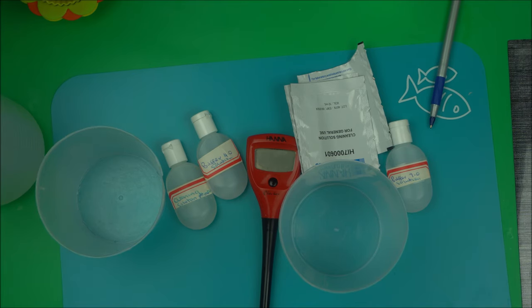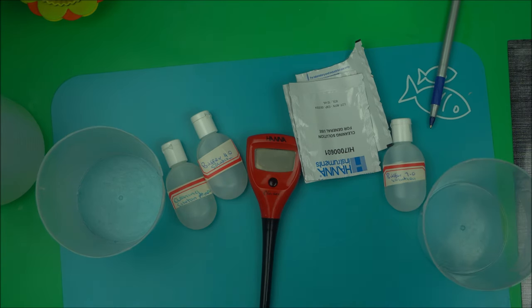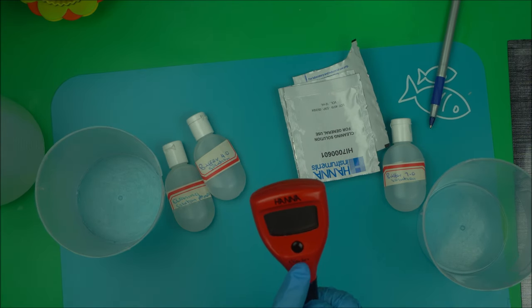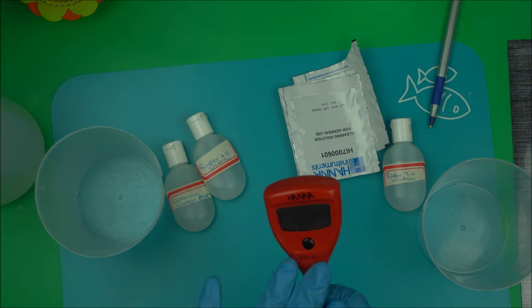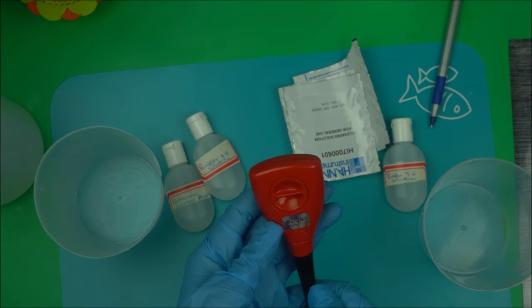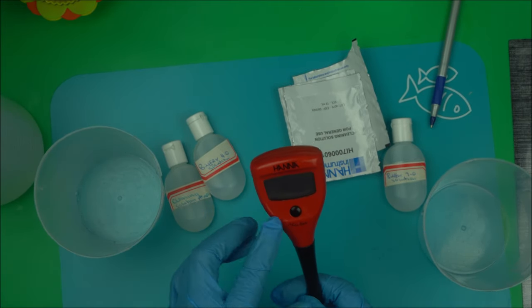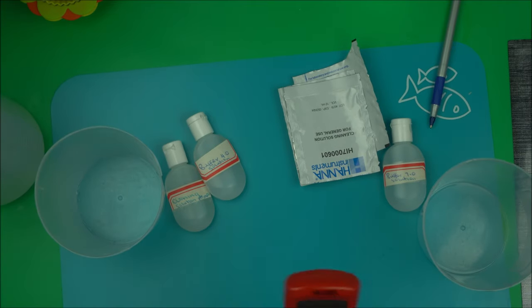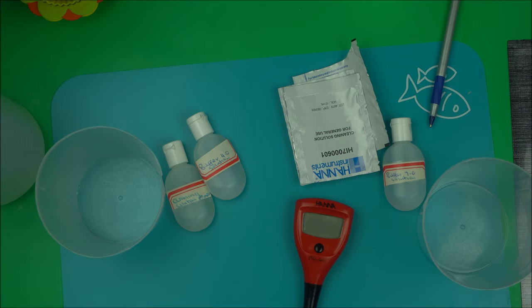Hello, welcome to Natural Skincare. In this highly requested video, I'm going to show you how to use and maintain your pH meter. I recommended this meter to everyone on this channel because this is the meter I use.